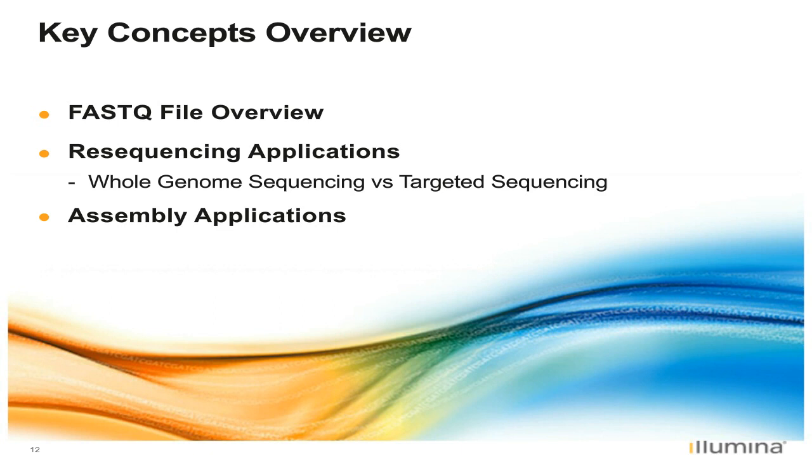Then we'll do an overview of assembly applications, how they work, how they're useful, and of course, we'll talk about RNA sequencing. Now, again, this is just meant to be an introduction and an overview. There are many other concepts and ways that you can analyze your genomic data, but these are basically our most popular ways and our most popular applications that we use with our data. Okay.